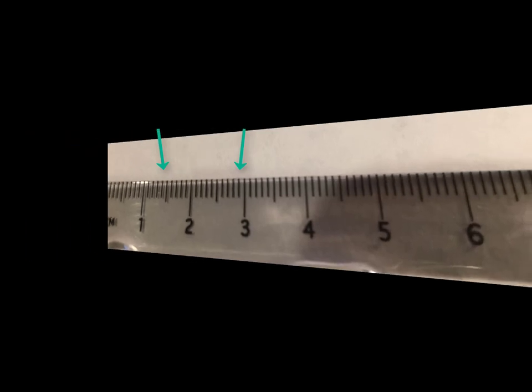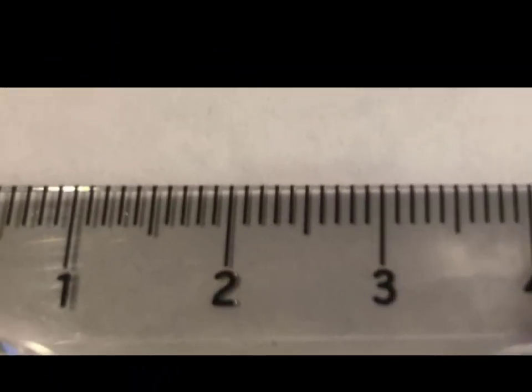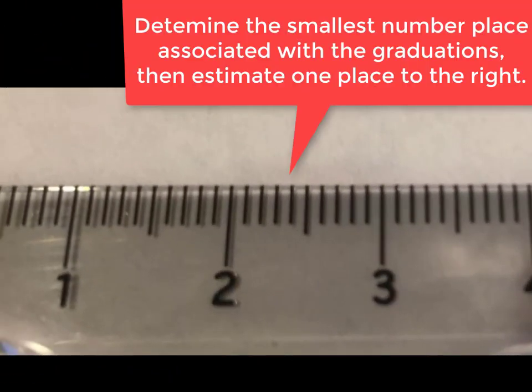Numerically speaking, the metric system is based on powers of ten. Therefore, a good metric scale should have its major divisions subdivided into tenths. The proper way to read any metric scale is to determine the smallest number place — ones, tenths, hundredths — associated with the graduations, then estimate one place to the right.